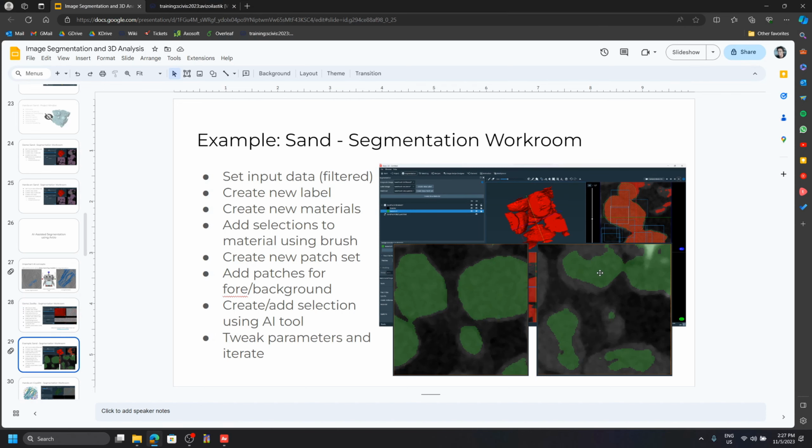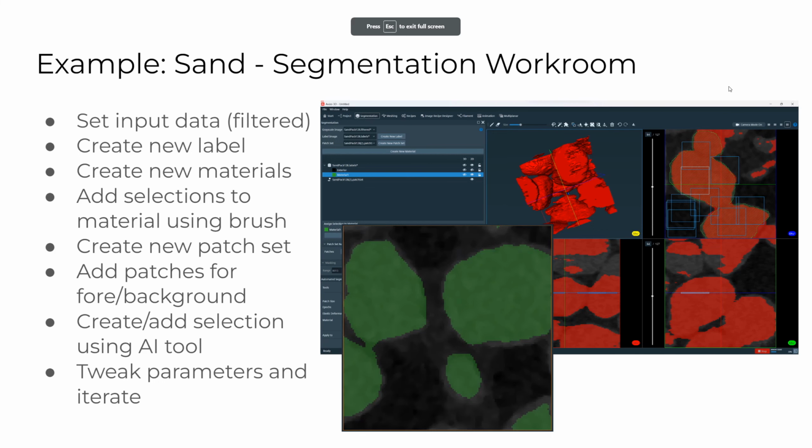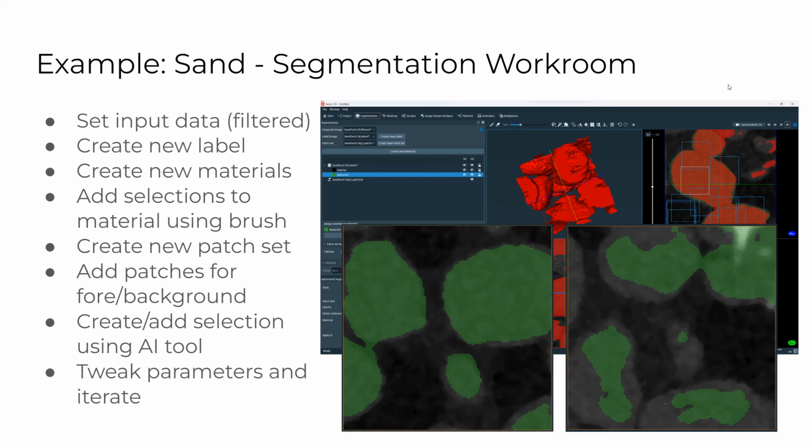If there was time, I was going to show it. I also would like to comment on this image. Diffraction patterns? I have no idea. What do you mean, diffraction?